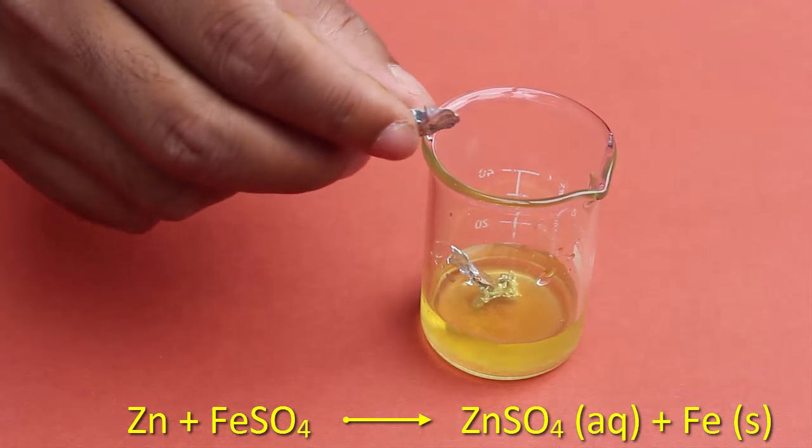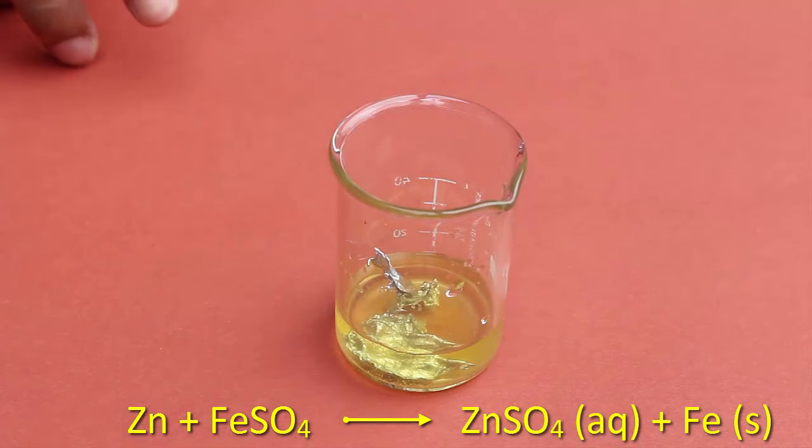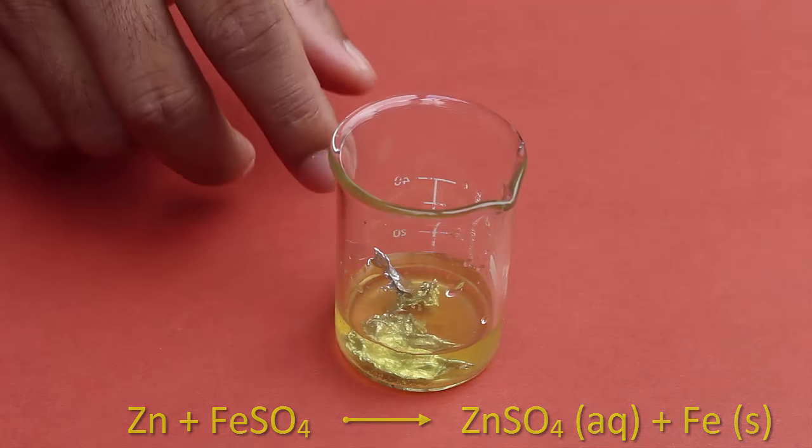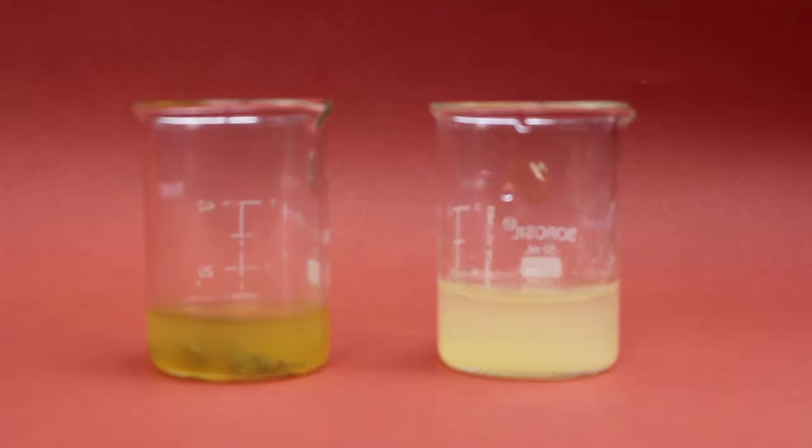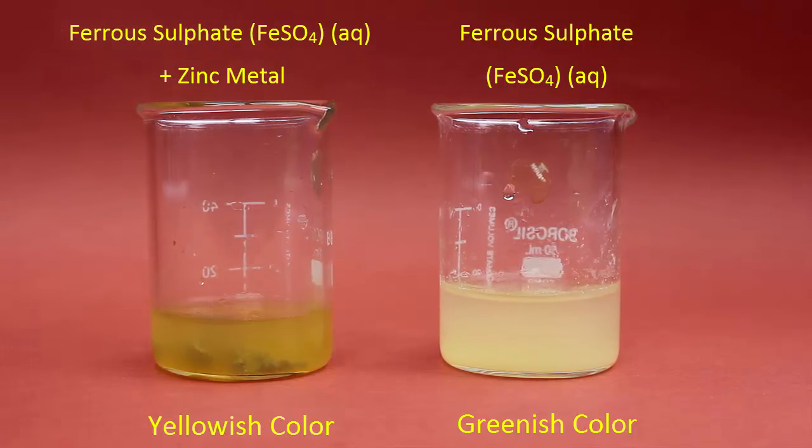So we are adding two pieces of zinc metal into the solution. The reaction will start but this reaction will take little time to complete. Now we can see the difference between the color of the solution.